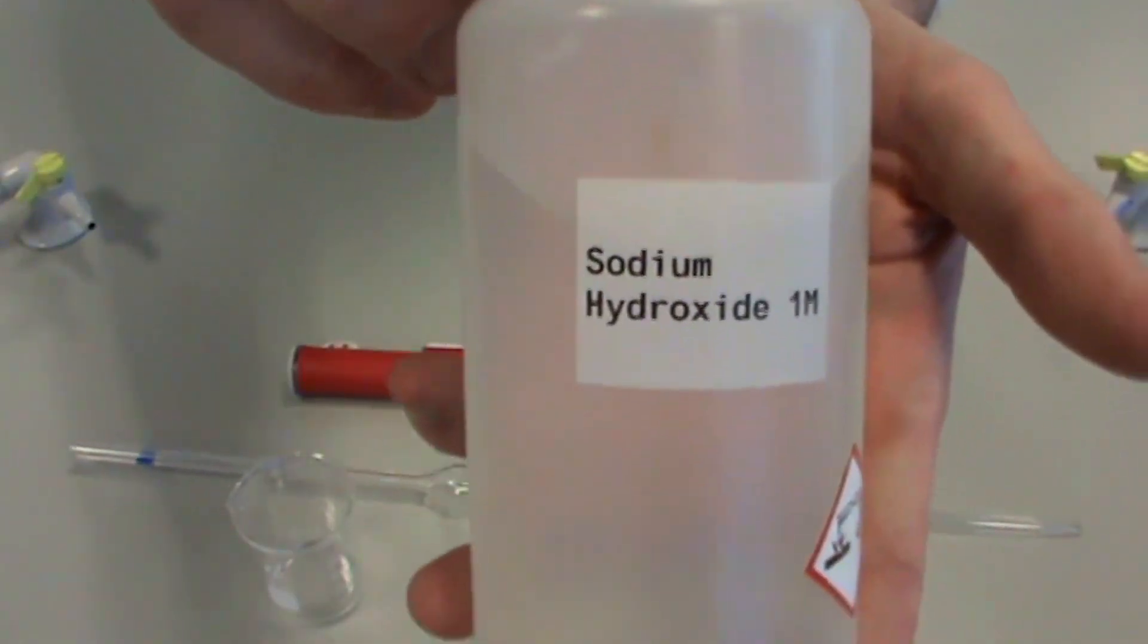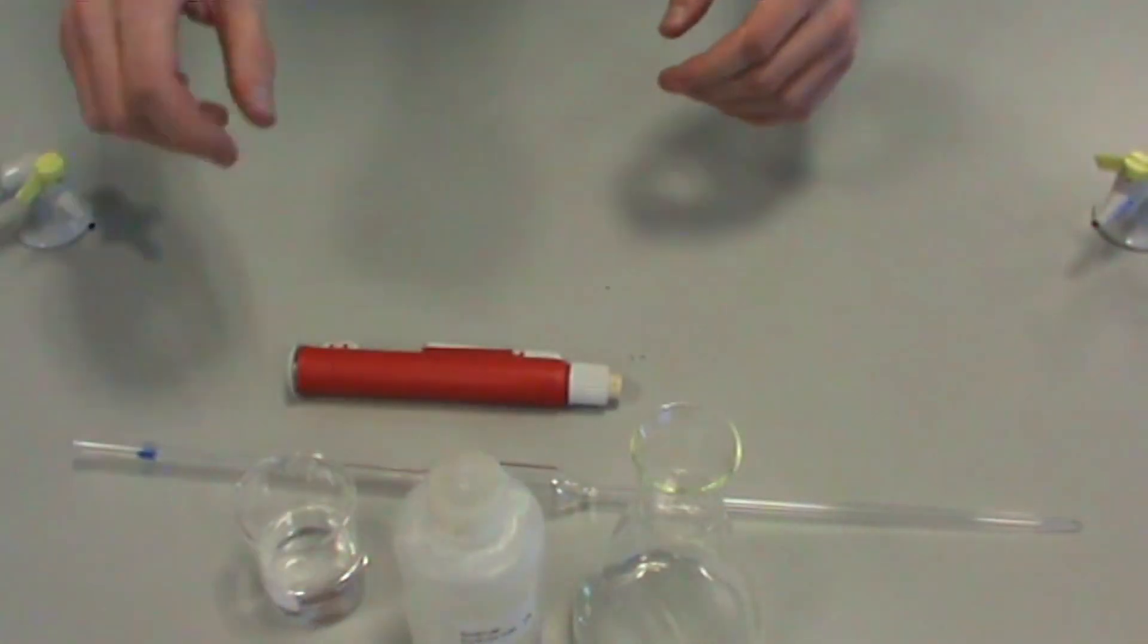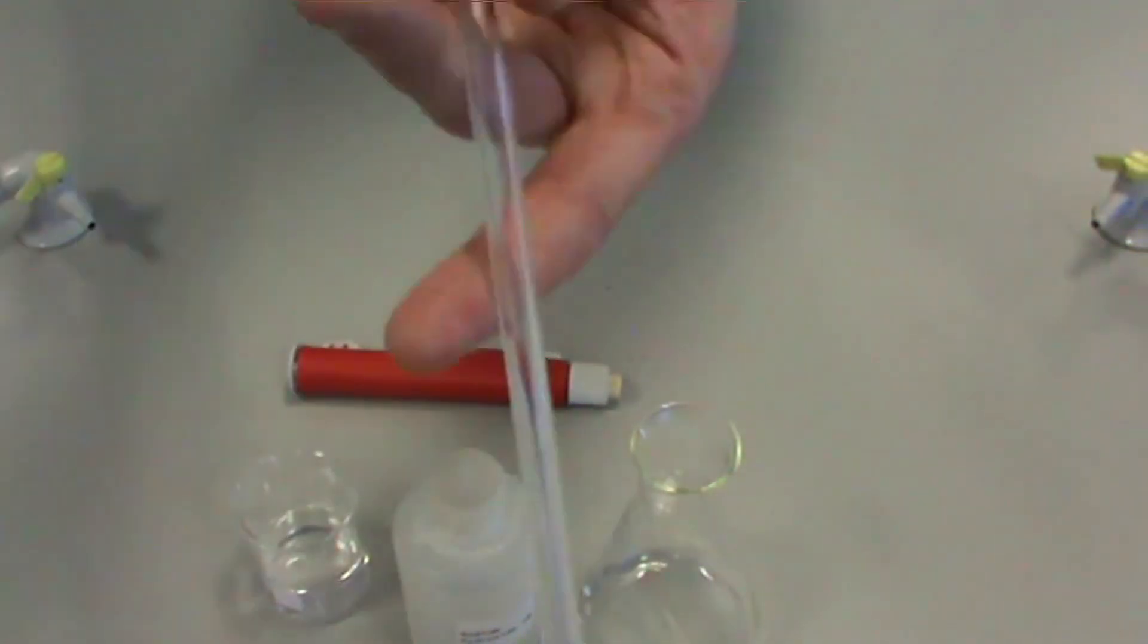To begin, pour some of your sodium hydroxide solution into a beaker. This makes it easier when pipetting in the next stage.